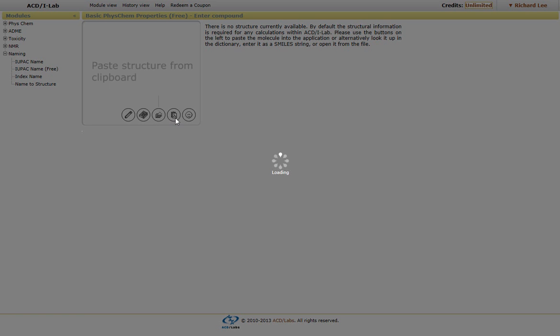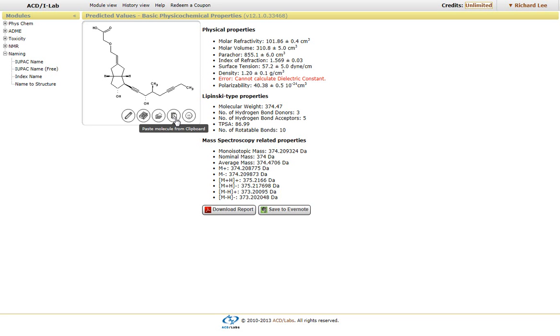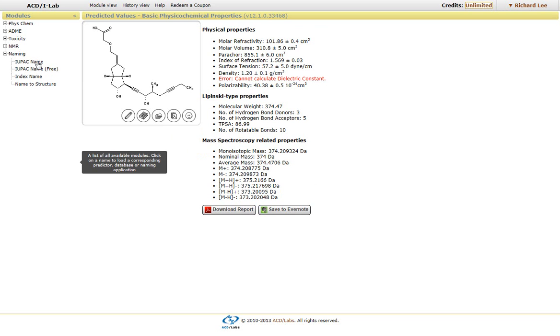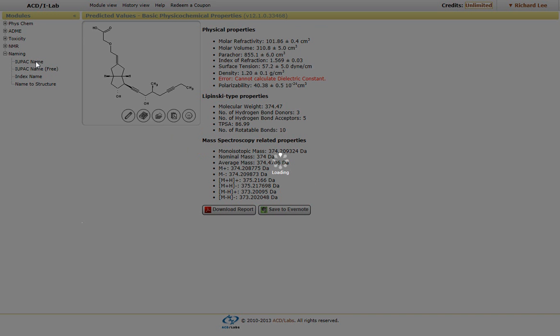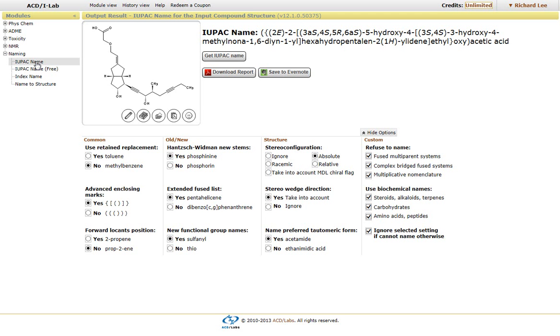I'm going to simply copy and paste from a ChemSketch window. You can do the same from a ChemDraw or an IsisDraw window. As soon as you import the structure, it calculates some properties. As soon as you click on the IUPAC name, it will generate the IUPAC name of the structure itself.